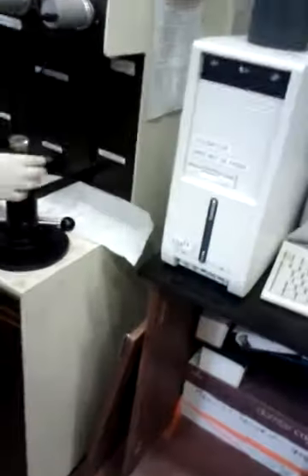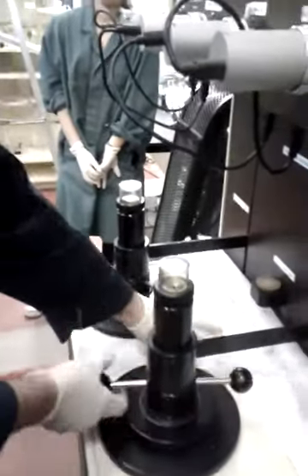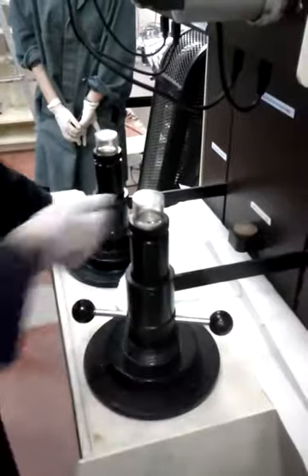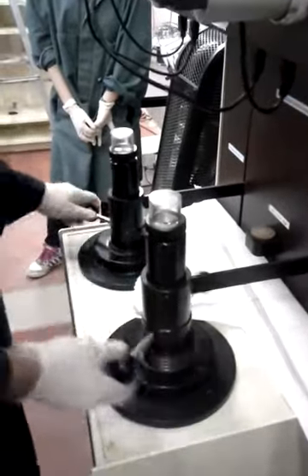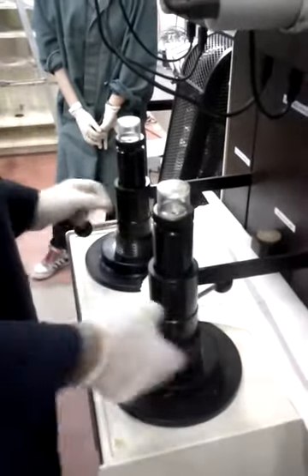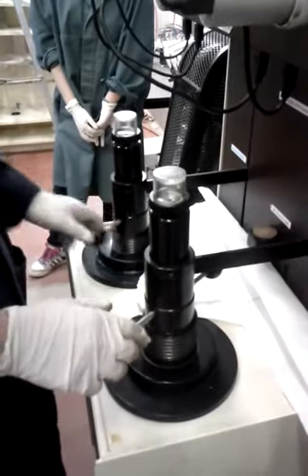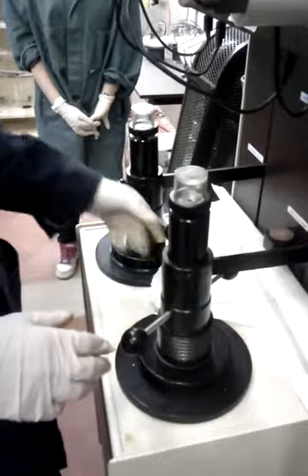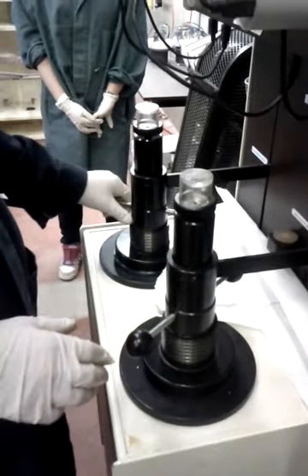So we have to open the thing and screw this.